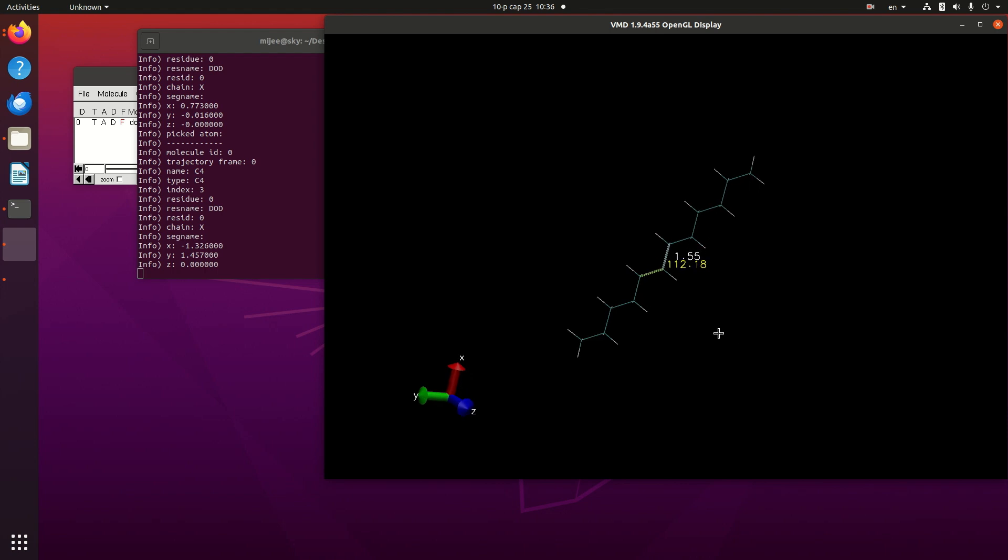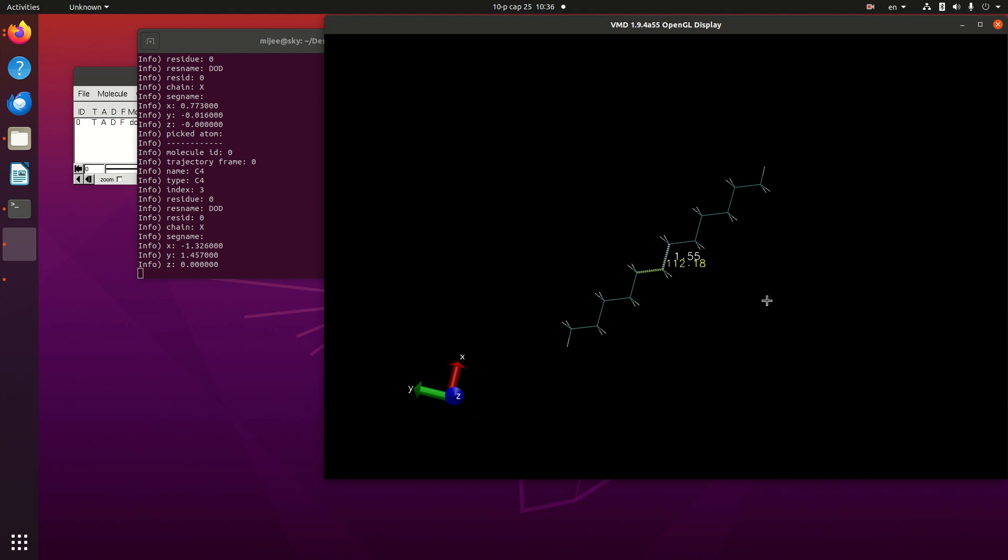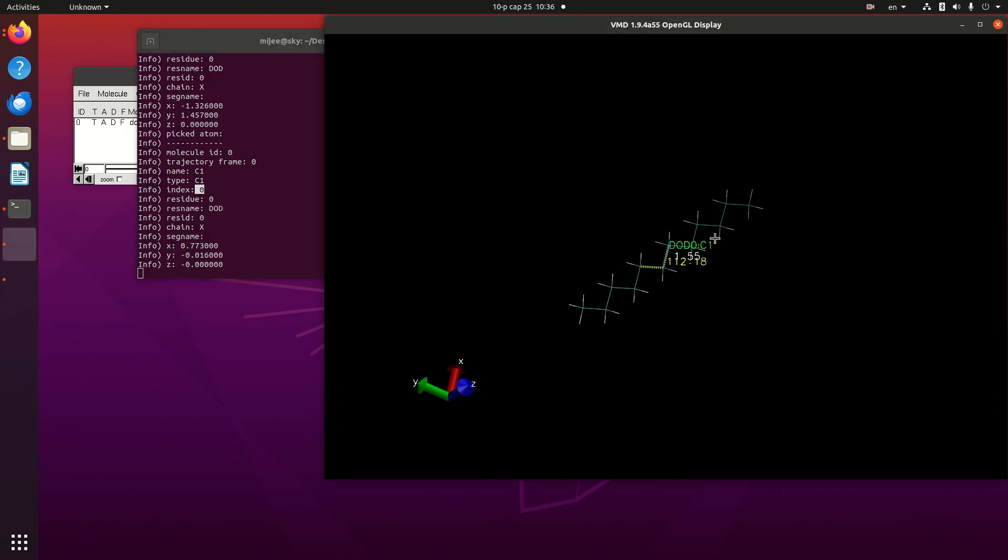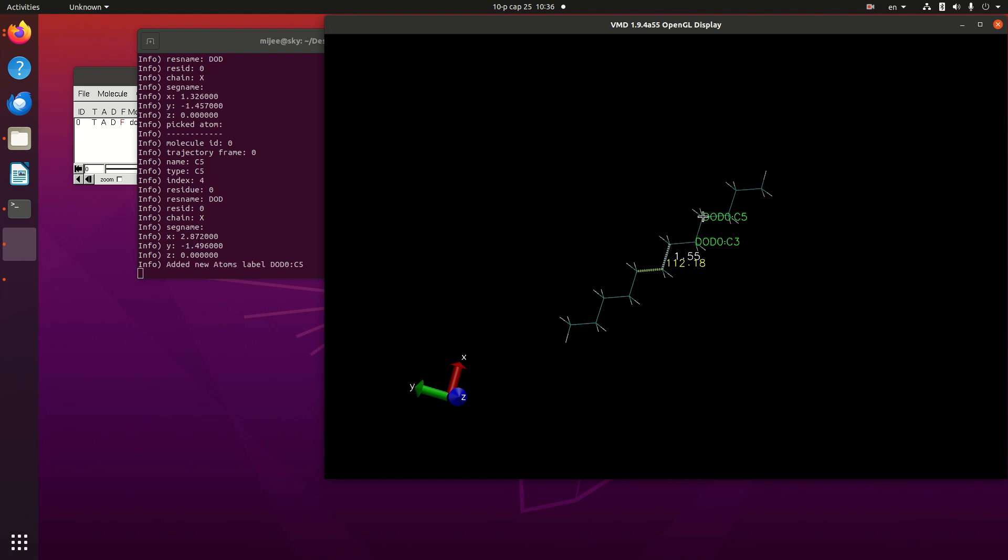At first, we should know these different groups' index or atom names. For example, I want to know this atom index. Index is 0, 2, 4.